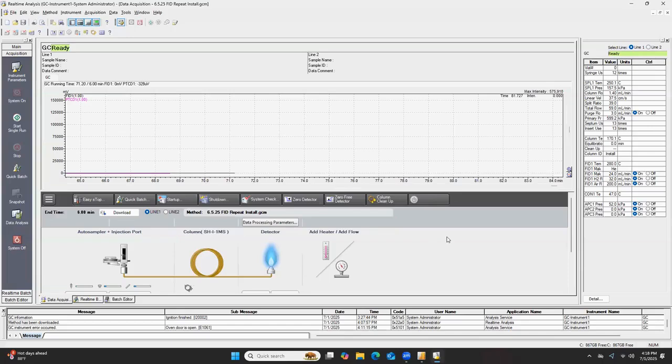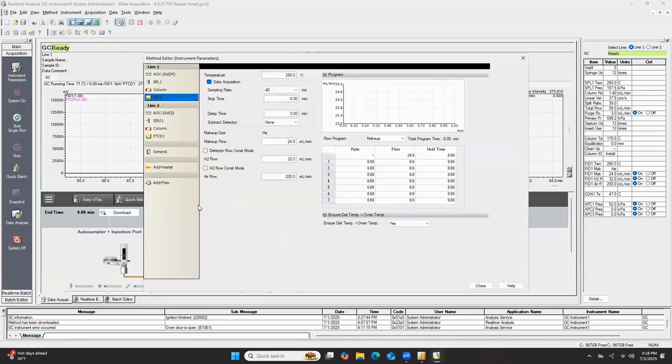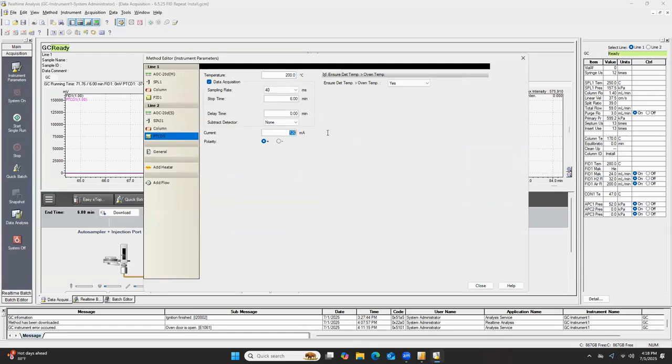Since it's already at its operating temperature of 200 Celsius, and we're not using it, we could have it set to 0. If we have a current applied to the TCD but we're not using the TCD, it's like sitting in your car in a parking lot while the engine is running for hours. You're putting strain on the motor, on the detector, whenever we're not even using it. So thank you for reminding me. I'll go ahead and change that back to 0. So TCD, change that to 0.